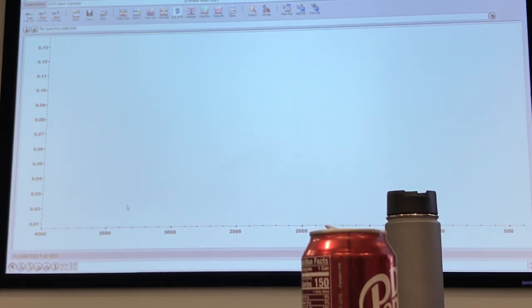And what else can it be? It can be transmittance as well. Yeah, it can be transmittance, it can be reflectance. It can't be transmittance if you're on a filter, right? It depends on the filter. Yeah, there are really thin Teflon filters that you can use. So let's say you have the best filter possible, and you want to set that up for the highest resolution possible using transmittance. What's the best resolution you could get?